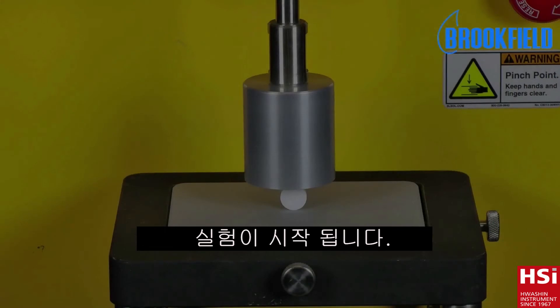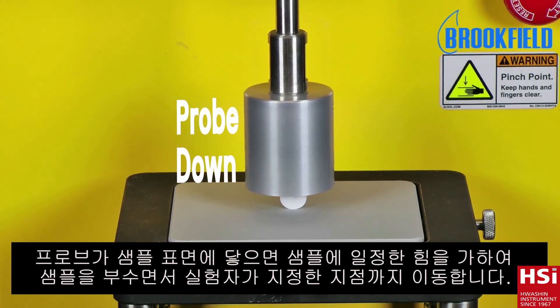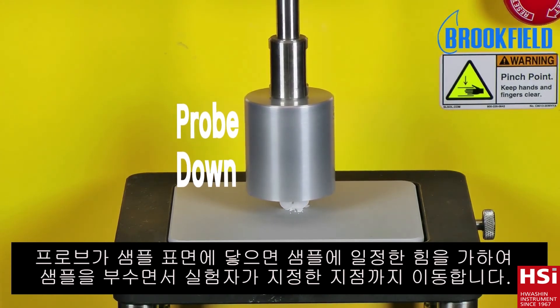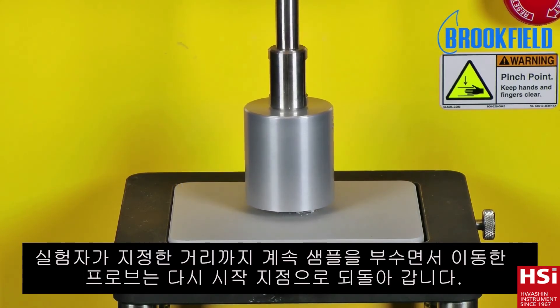The test is now ready to begin. At the tablet surface, the cylinder probe exerts an increasing force on the tablet to the point where the tablet begins to crush. The probe continues to crush the tablet covering the target distance before withdrawing from the tablet and returning to its starting position.